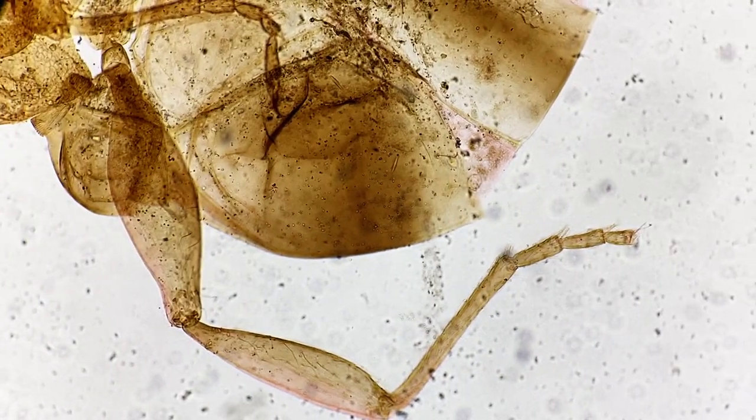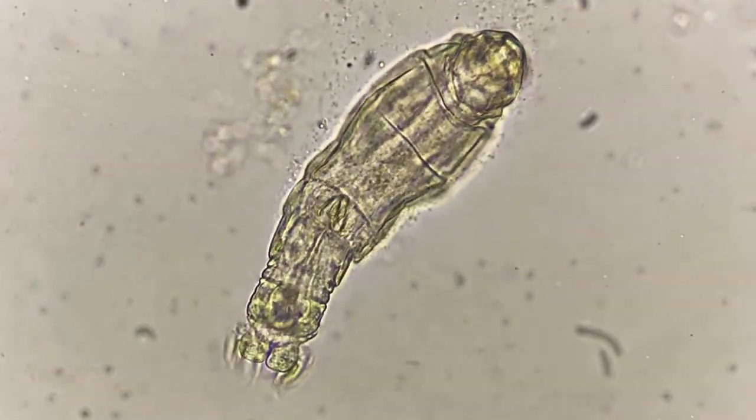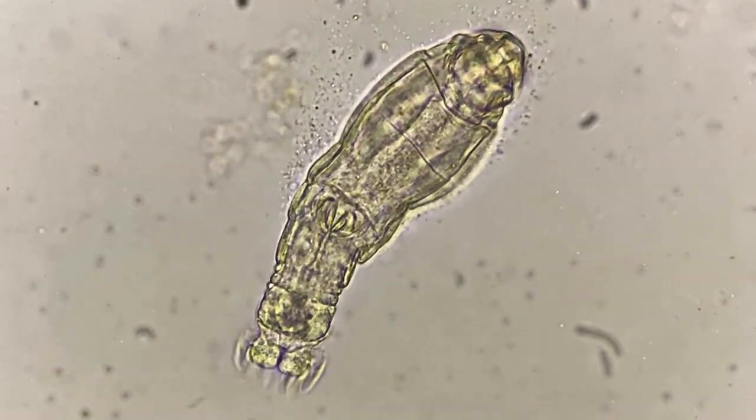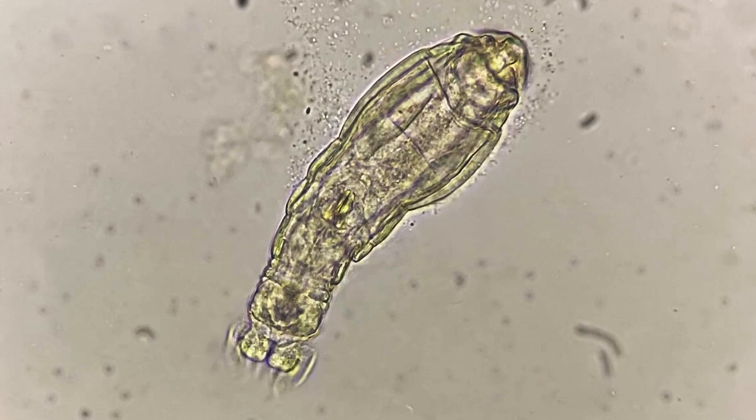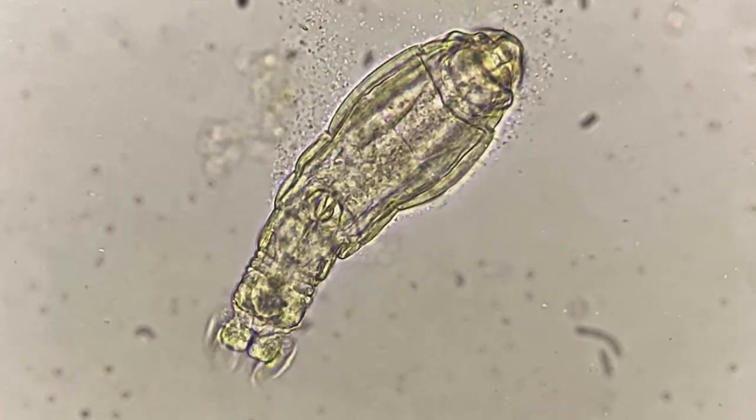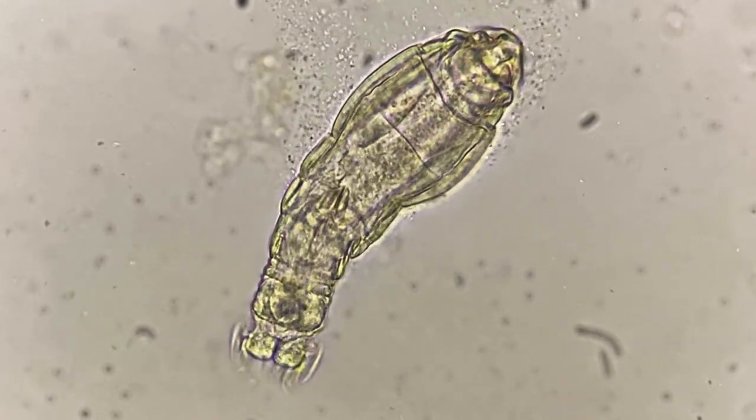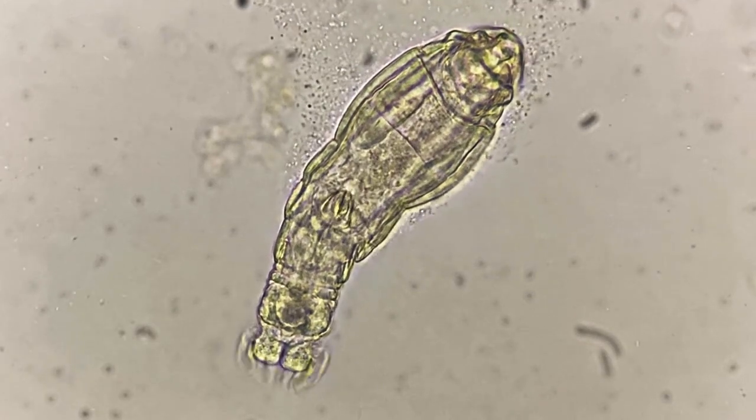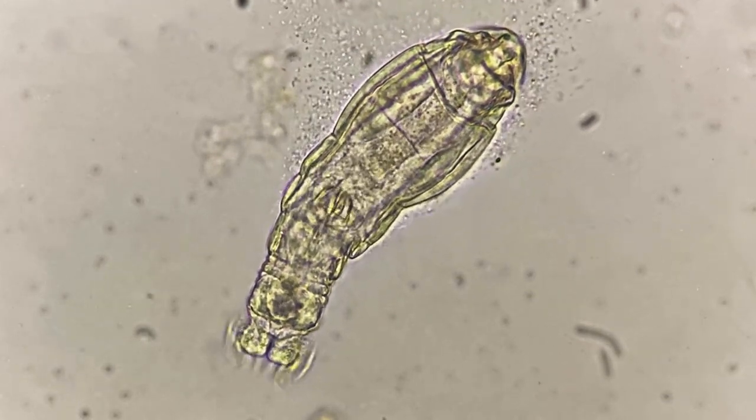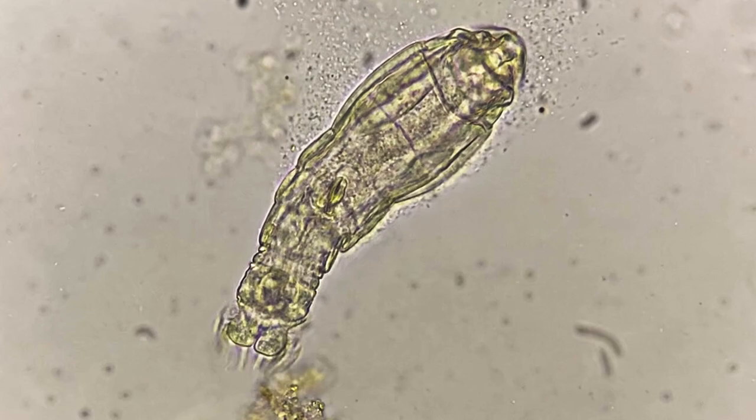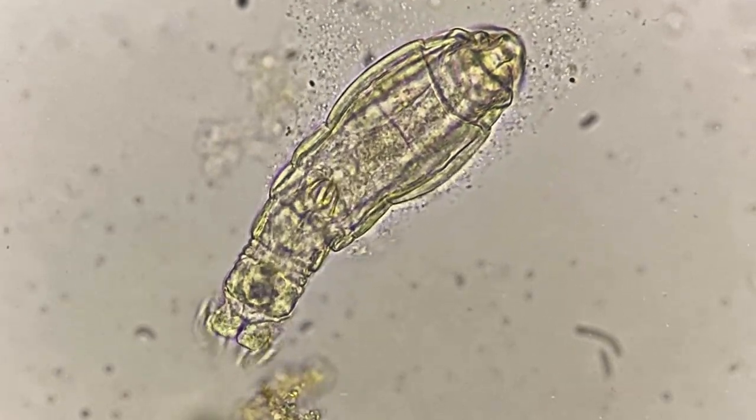Also some moving images, a rotifer as taken with the iPhone and this adapter here. As you can see very usable and a very nice and practical result.